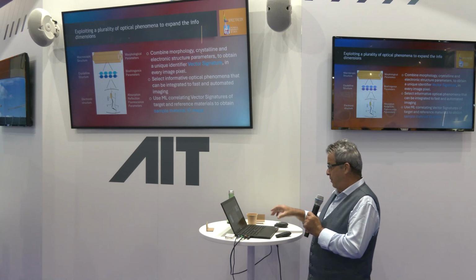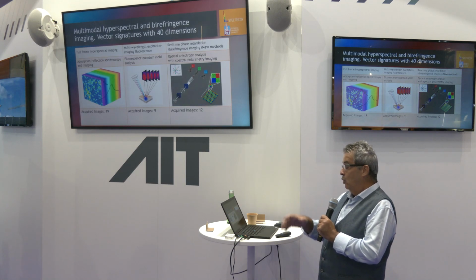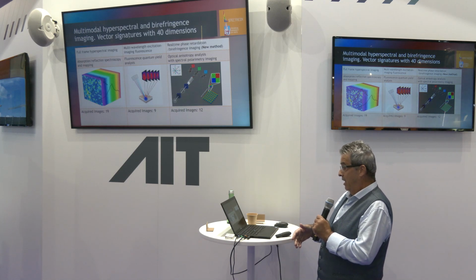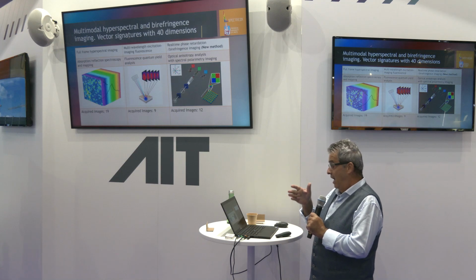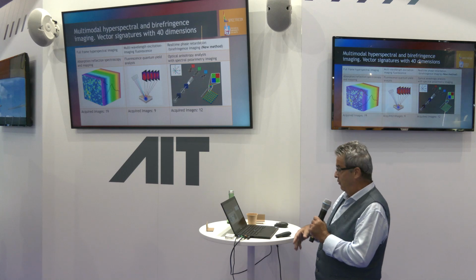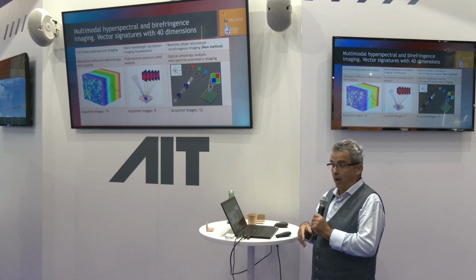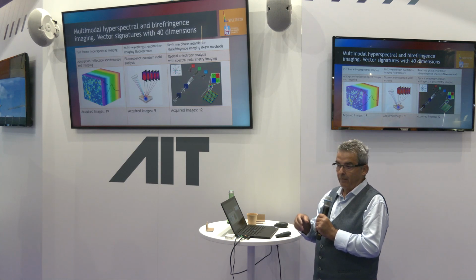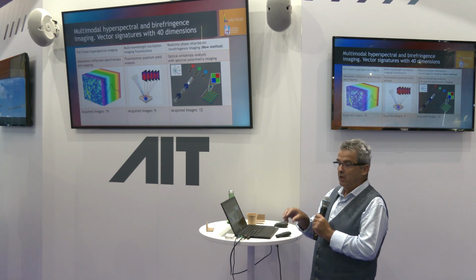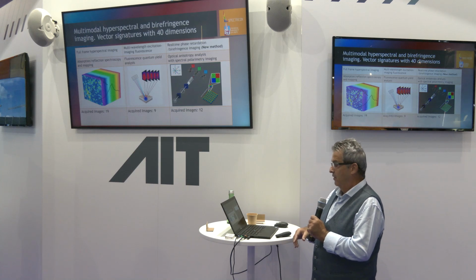So the multisensorial aspect of our system is that it can do snapshot real-time hyperspectral imaging with the devices that we have developed. We do multi-wavelength fluorescence excitation using multiple lasers for fluorescence excitation and multiple wavelengths for the imaging. And we also use polarizing microscopy, but the particular contribution is that we have developed a method to measure the birefringence in any pixel of the specimen.